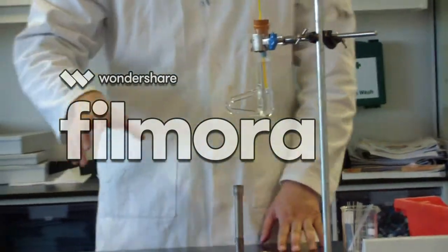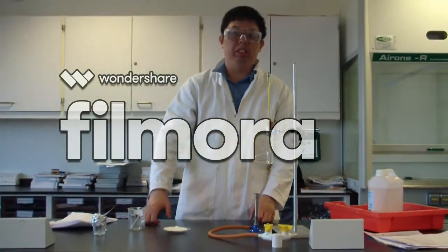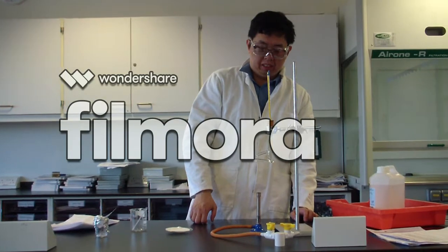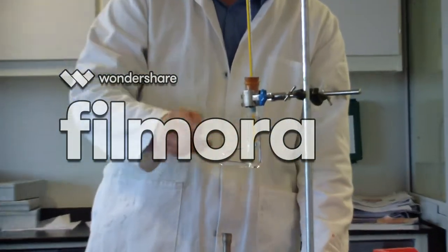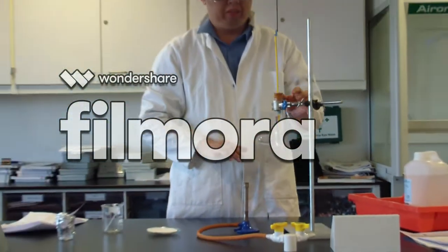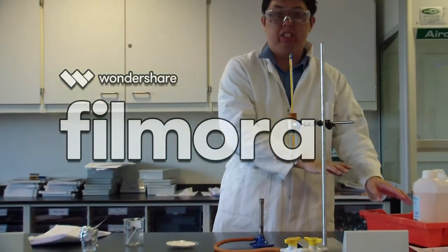What we expect here is a very sharp melting point. So if it melts at, say, 200 degrees, it should melt around that temperature. If it's impure, it will melt across a wider range of temperatures. As you can see, it starts moving, so the heat is slowly circling around, and it's done. And that's how you do the melting point. Now we wait for this to cool down, and then we can put the glycerol back inside the glycerol bottle.